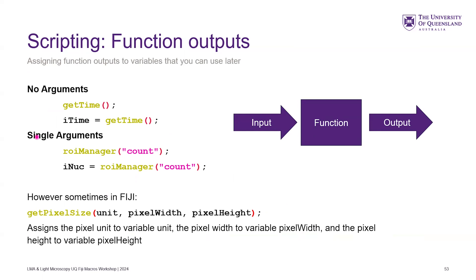Just a reminder: we've got things like get time with no argument, single argument things. This can be used in a for loop, or you can also just define a variable and have your for loop refer to that — it can help with debugging. Sometimes if you run multiple of these functions, we've encountered getDimensions before or getVoxelSize. What this does is you've got this unit, pixel width, pixel height — these are like collections of variables that it will populate with whatever the image has.